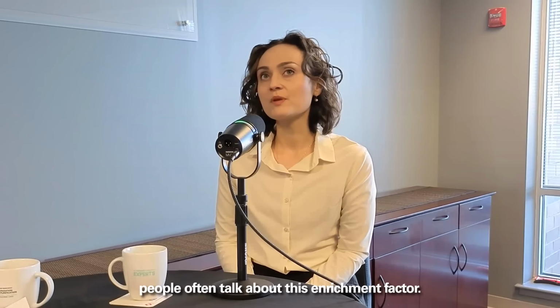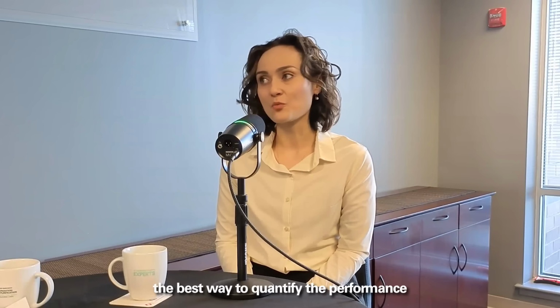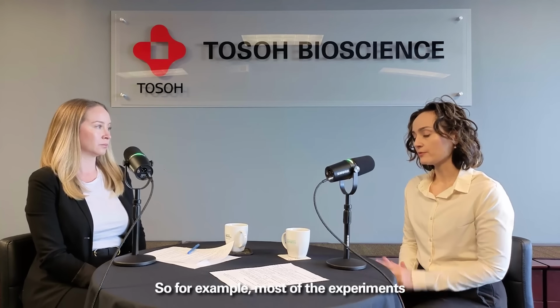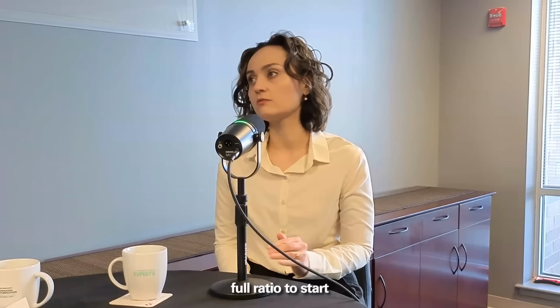Right. So, talking about enrichment, people often talk about this enrichment factor. I don't think that's the best way to quantify the performance because it's so dependent on the start concentration. For example, most of the experiments had about a 50% full ratio to start with after affinity purification.